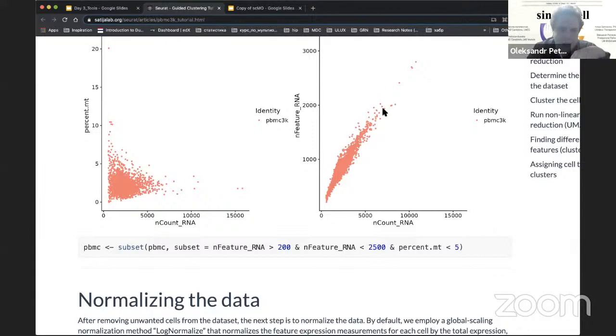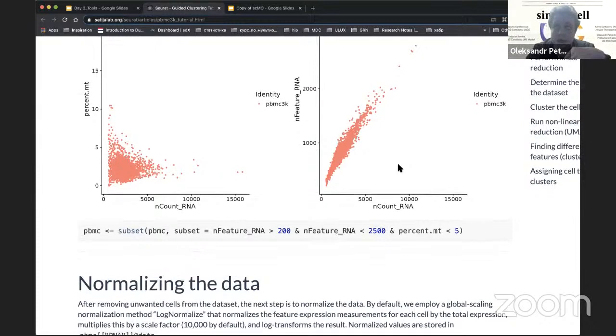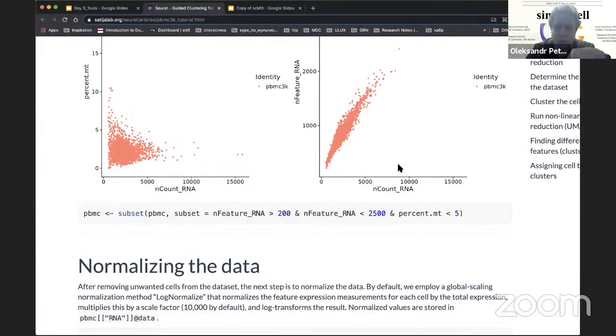And we have a small question regarding specifically this point. Could you please compare good quality and bad quality data? It's something, if I remember correctly, we will see tomorrow when we work through the workshop, because in one data set we will have super noisy cells and the second data set will be super clean. So you will be able to see it tomorrow in the session.